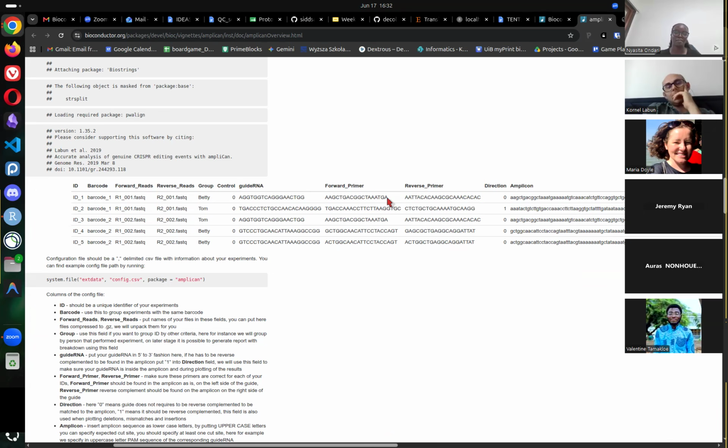I see. Yeah, this is a difficult case. I would recommend using nanopore sequencing for that. If you use nanopore sequencing, you can have long primers. You specify very long primers, and you do this nanopore enrichment. You do PCR on those long primers, and you sequence that.